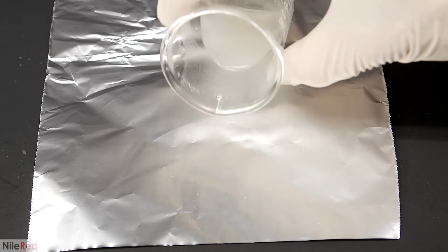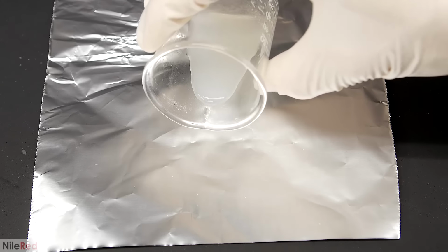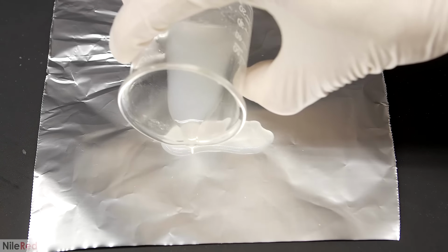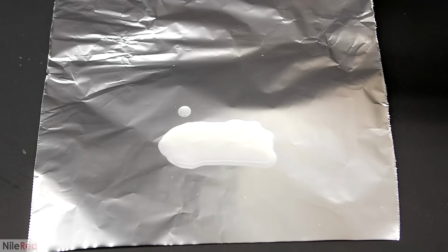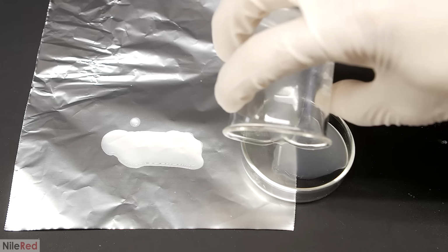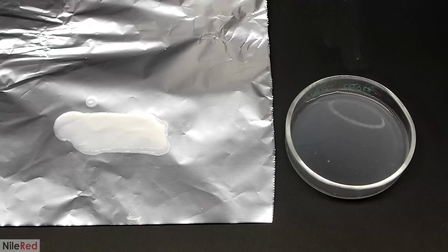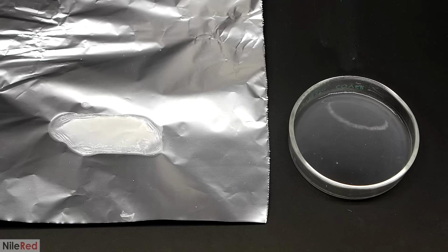To make the films, I just need to pour it out and let it evaporate on something, but I wasn't sure what it would work on. I just had to try it out for myself, so I poured some onto aluminum foil and the rest into a glass dish. Then I just waited for the acetone to evaporate, which took quite a long time.